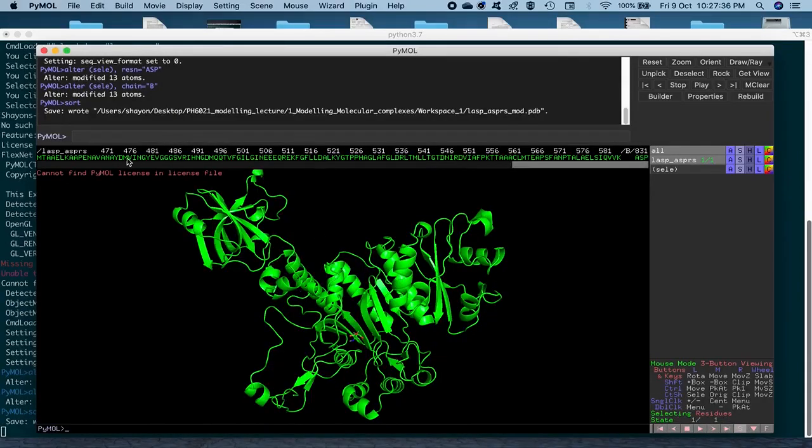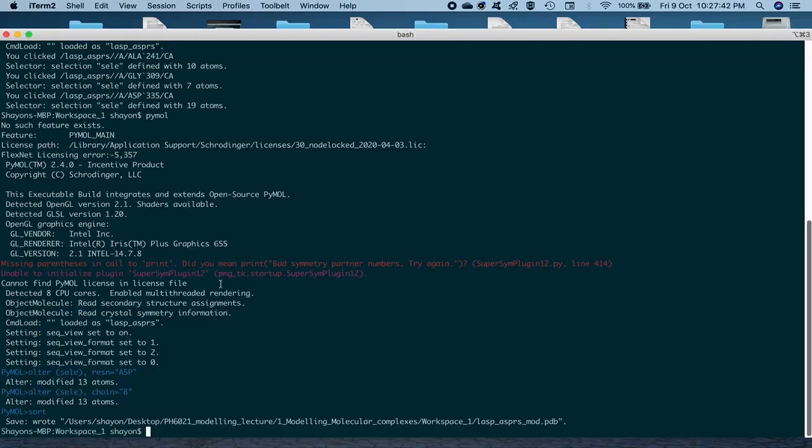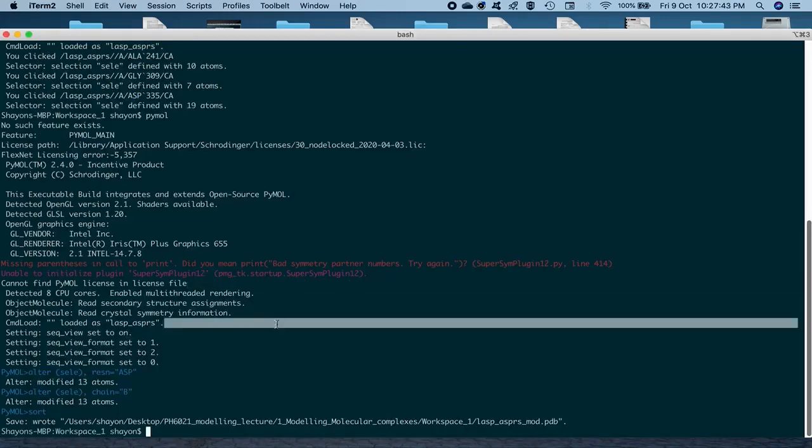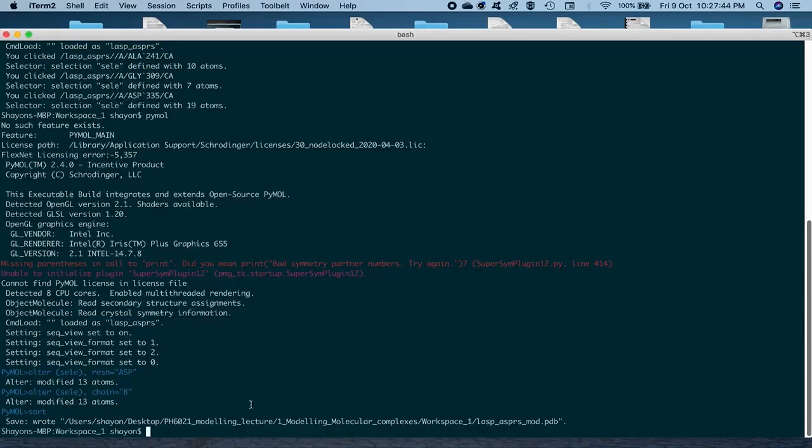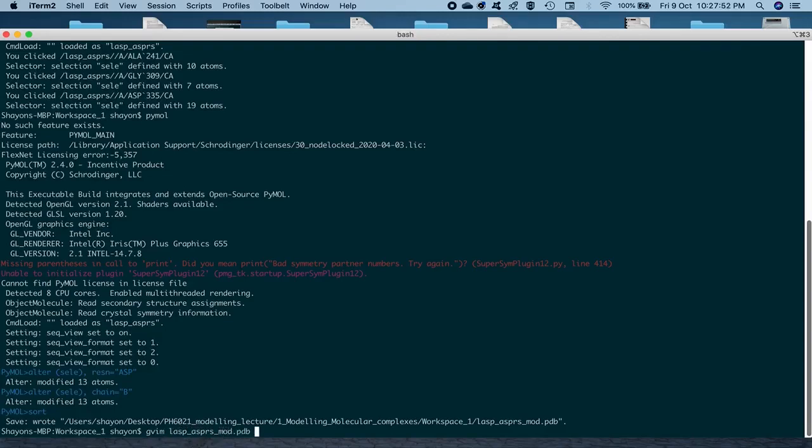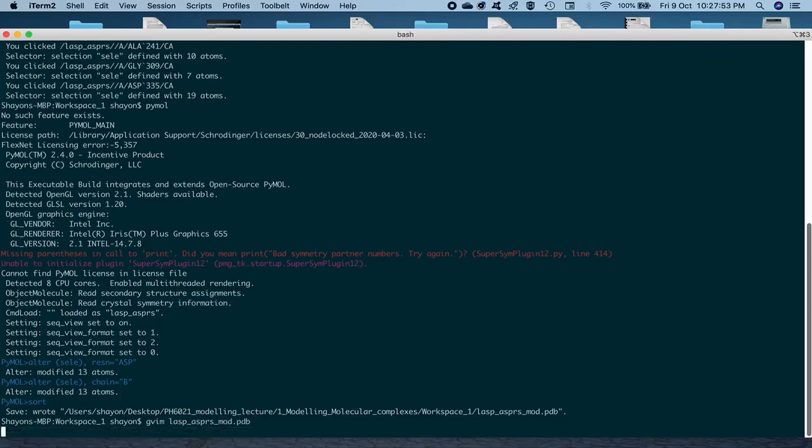So, if you want to have a look at it in the text mode, we'll just close PyMOL. And then open it with your favorite text editor again. So, I'm going to use GVIM. So, ASPRS MOD.PDB.